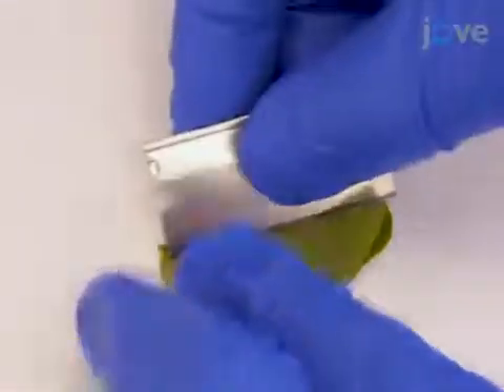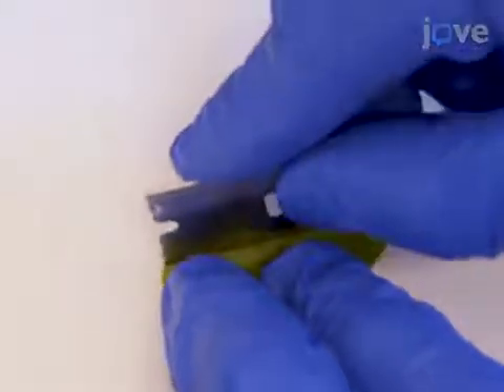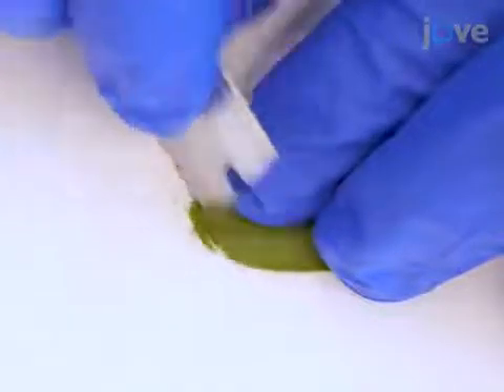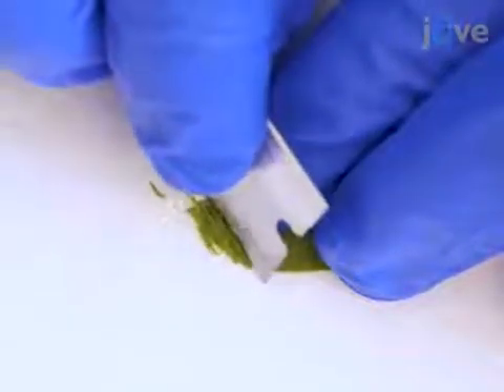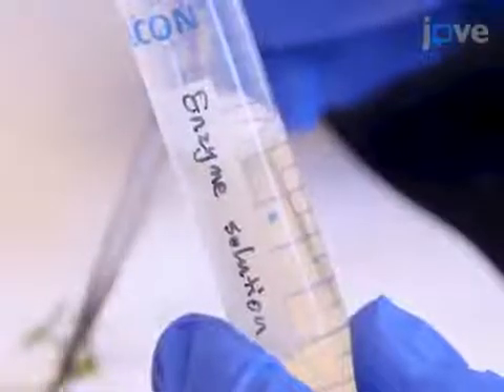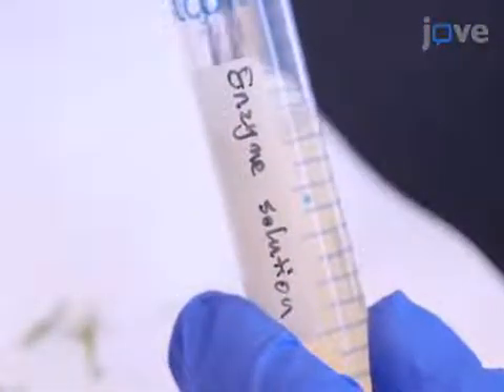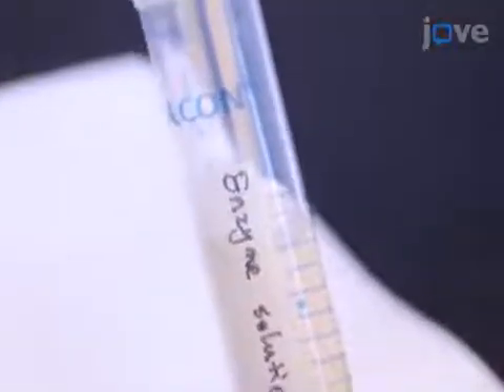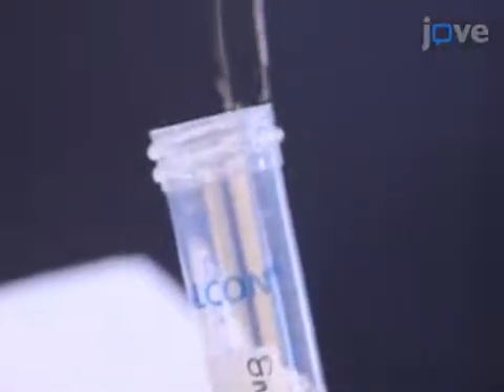With a fresh razor blade, remove the mid-rib from each unifoliate leaf, and then cut the remains into 0.5 to 1 mm strips. Using a pair of forceps, gently transfer the leaf strips immediately into 10 milliliters of freshly prepared enzyme solution in a 15-milliliter tube.